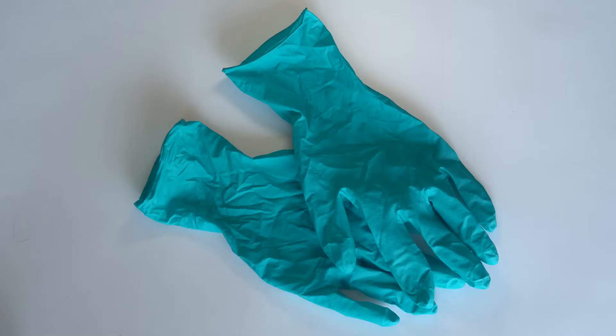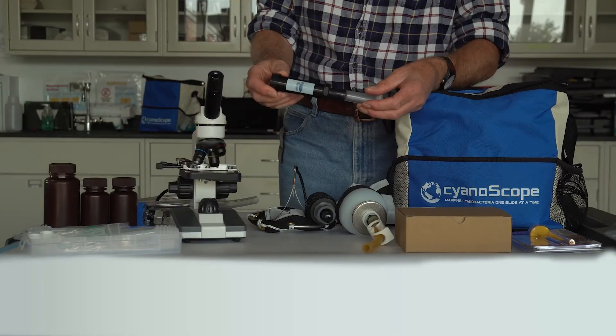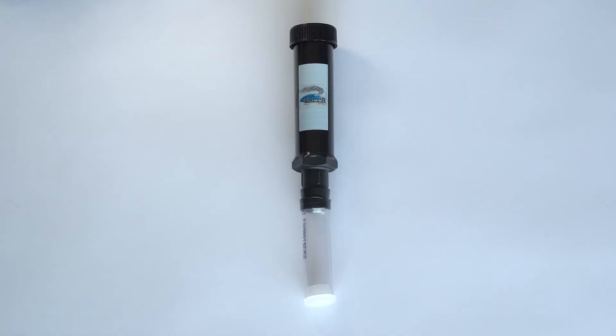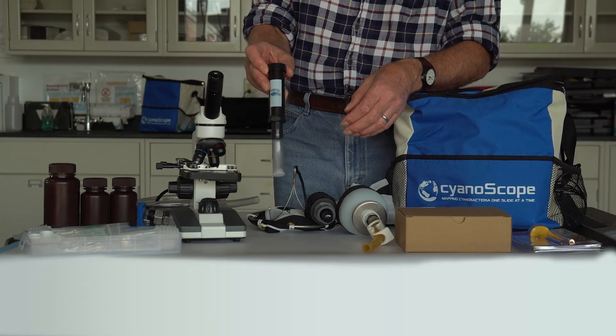Gloves are also included to protect your skin from the cyanobacteria. The pocket zapper is a tool that helps you gather a sample of cyanobacteria. To use it, you will pour a small amount of collected material into the zapper and stand it upright by clipping it to the side of the bag for approximately 30 minutes.